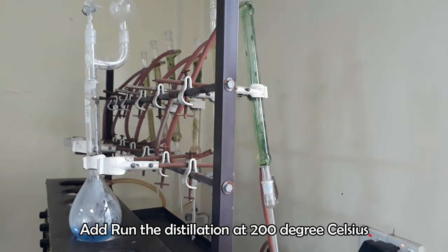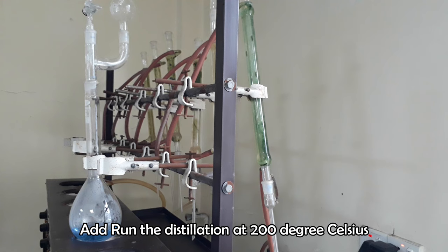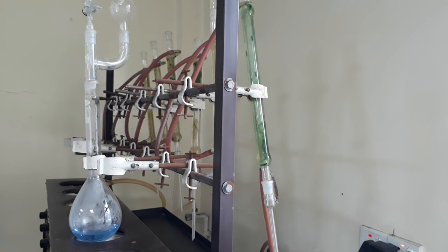Run the distillation unit and heat at 150 to 200 degrees Celsius. Don't forget to turn on the water circulation pump of the condenser.